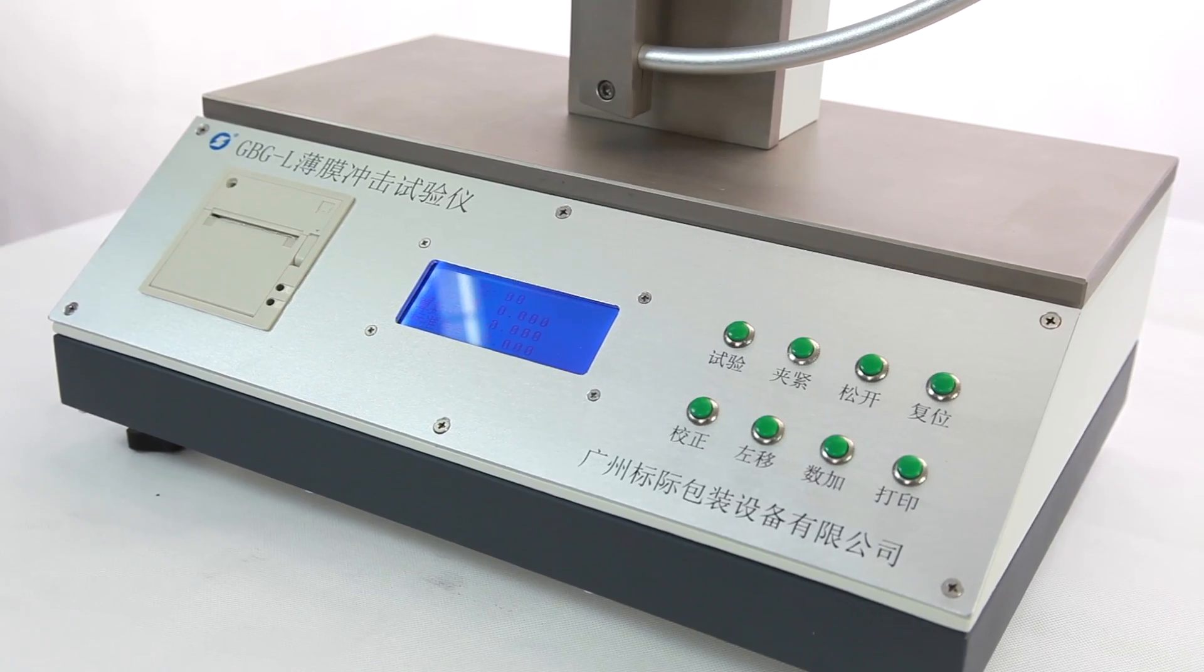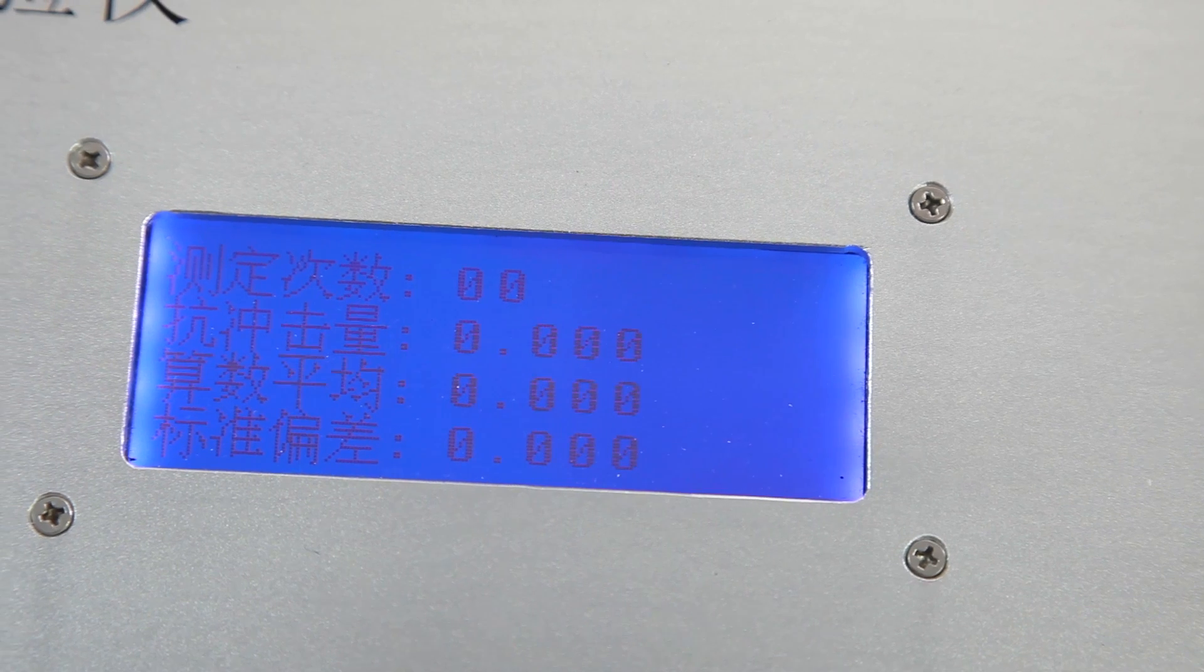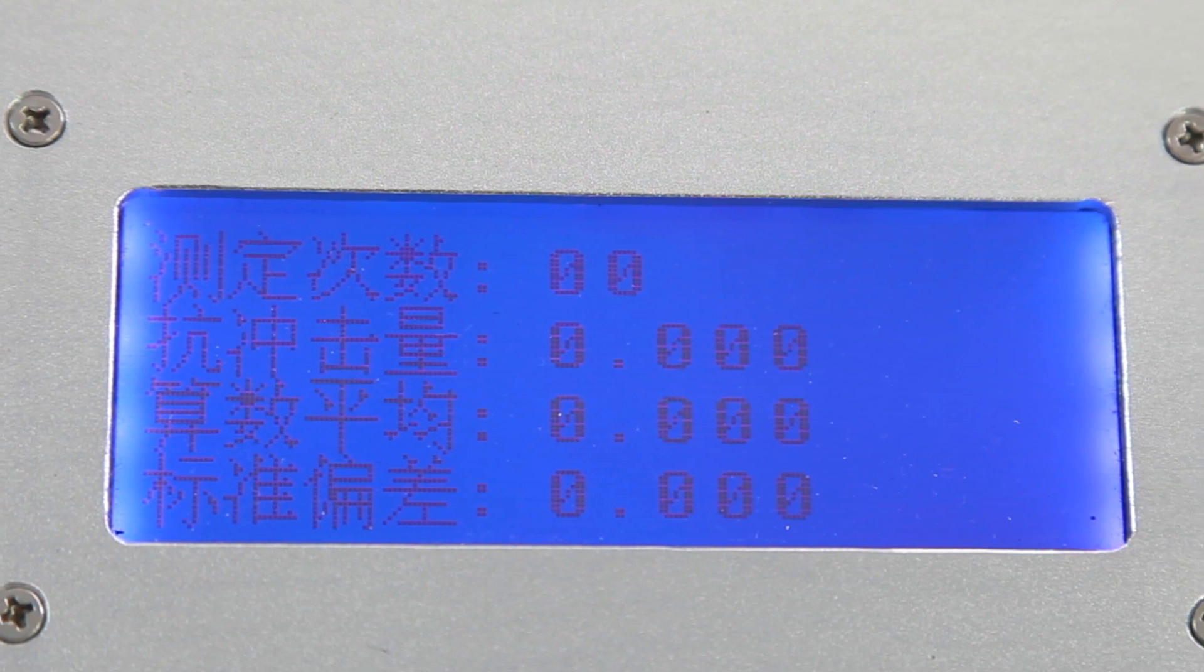It is high precision with accurate test results. It is easy to use, specially designed for flexible packaging.